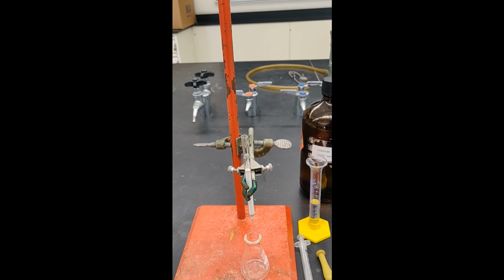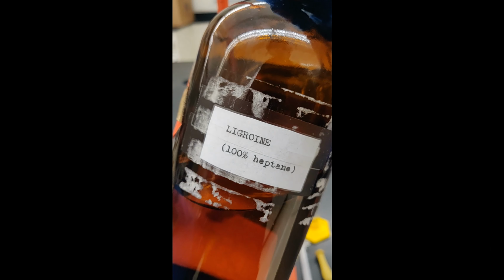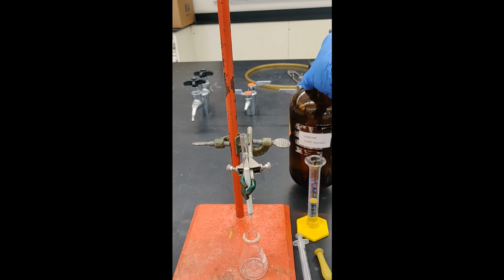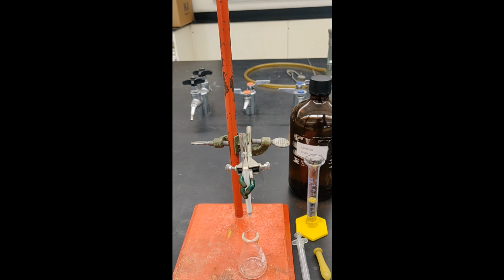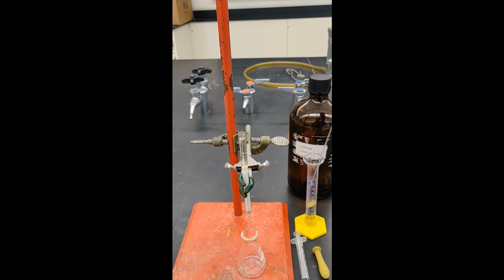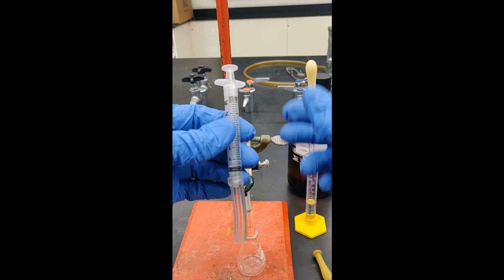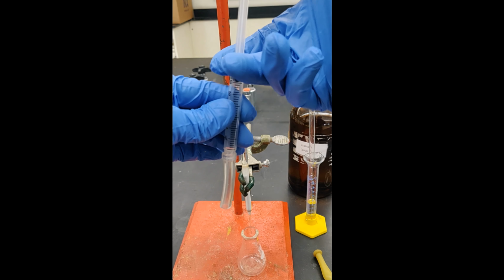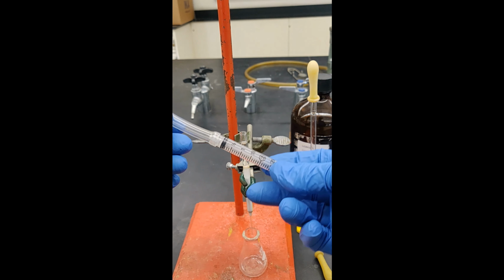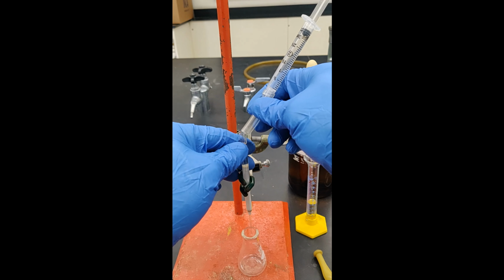Use a 3-pronged clamp and clamp holder attached to a ring stand to support the column. Fill the empty space above the silica with Ligroin. Use either a rubber bulb or this syringe pressurization device to pack the column by forcing Ligroin through the silica gel, which packs the stationary phase tightly to achieve better separation of pigments.